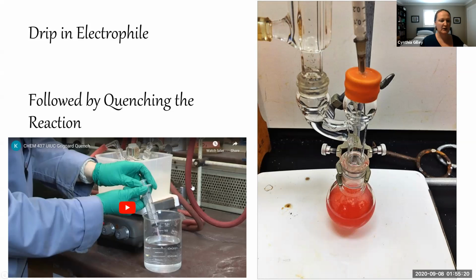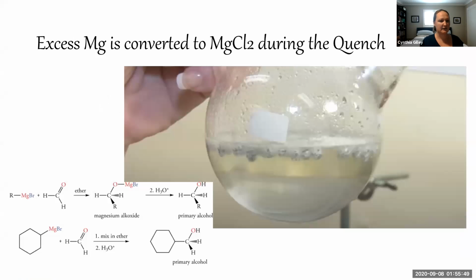Remember, to quench the reaction, that's when we introduce water and aqueous acid. Here's another video that you can watch that shows the addition of saturated aqueous ammonium chloride, which is an acidic aqueous solution, to quench a Grignard reaction. You could also additionally add aqueous HCl or aqueous H2SO4. All of those will do the job to quench the reaction. What does that involve? That involves adding, again, the water or the aqueous acid to the solution.